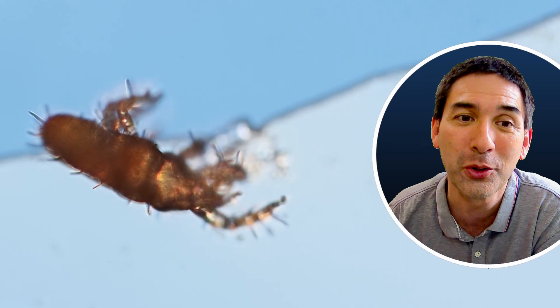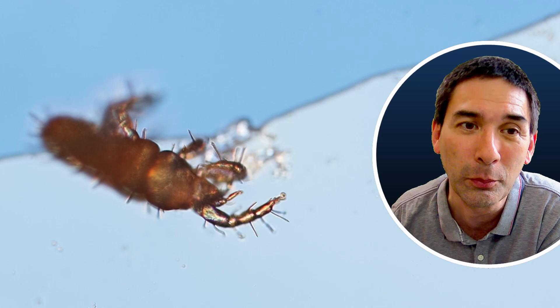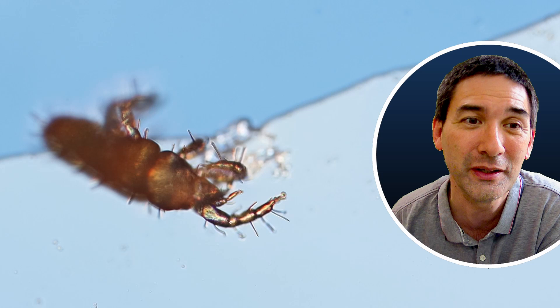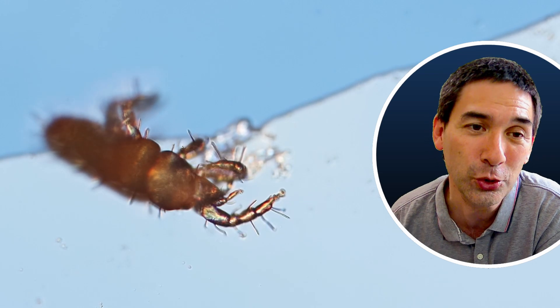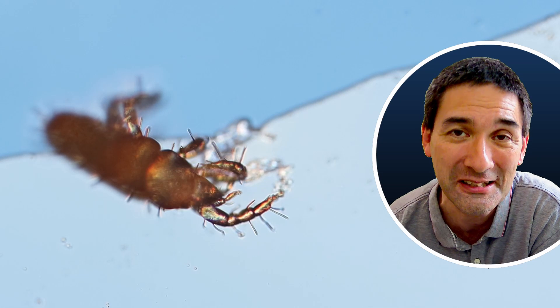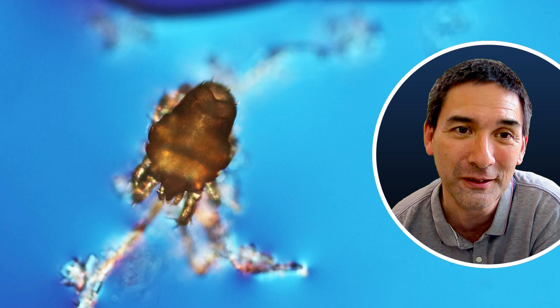Here we are again — you can see this one caught in the droplet of glue on the microscope slide, still moving around a little bit but already pretty weakened. I tried very hard to get a better image, but picking up those mites with a tiny needle is not so easy. Here we also see a top view of a different one.